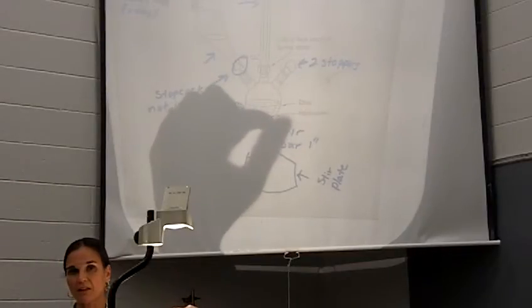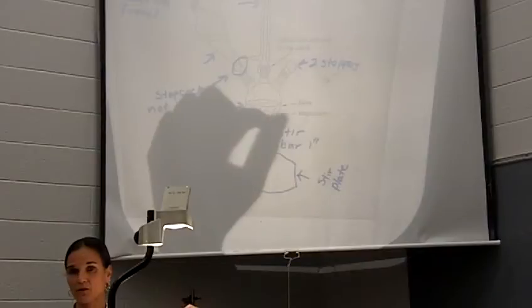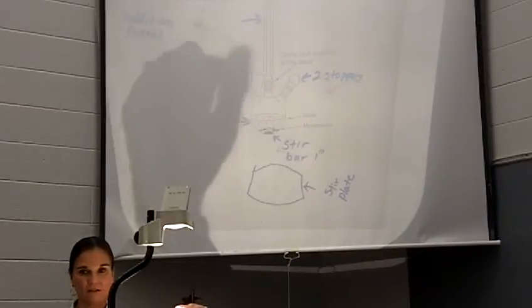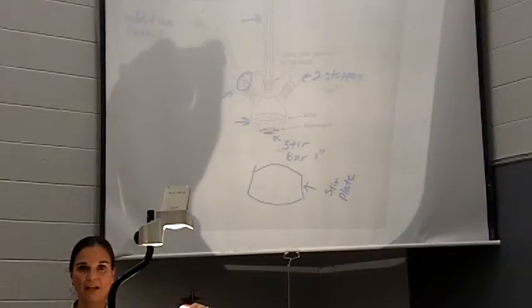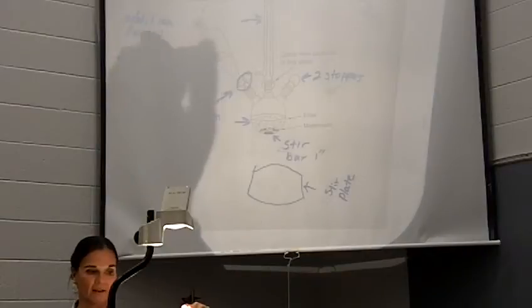Now remember, where does the ether come from? Reagent hood, not the red can. Okay, this is our dry ether. Then over here, we need our alkyl bromide and 40 mils of which kind of ether? Dry ether, right? No red can ether, okay? Not yet, all right?